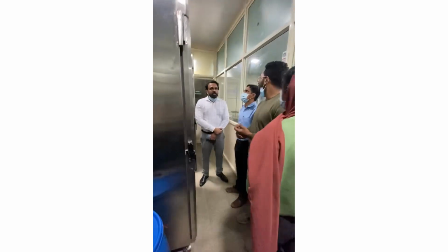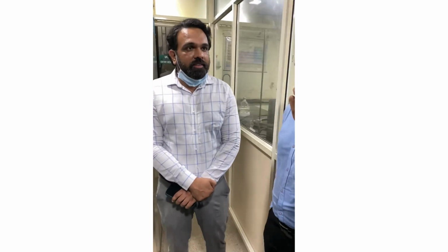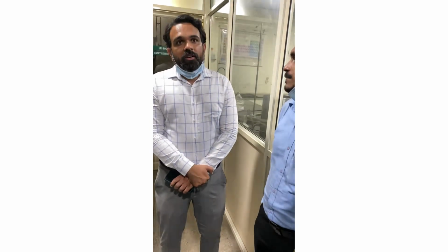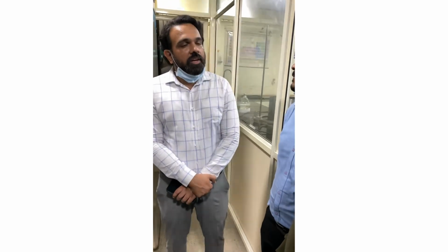See, this is the stability chamber. As the name indicates, it defines the stability of your product, whether your product is stable or not stable. Whenever you are launching or introducing any new product, it should be subjected to all the physical, chemical and microbiological analysis, like I told.